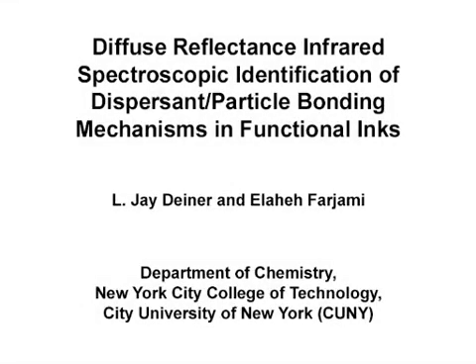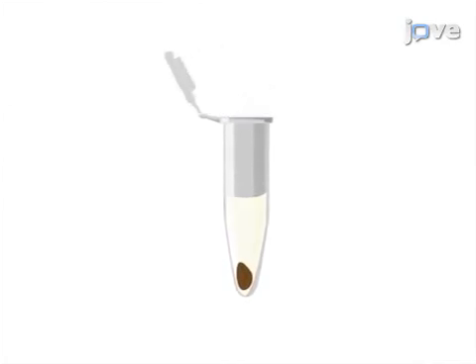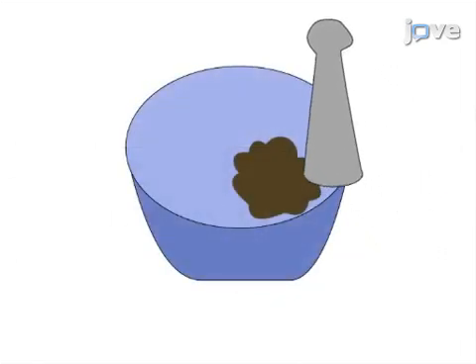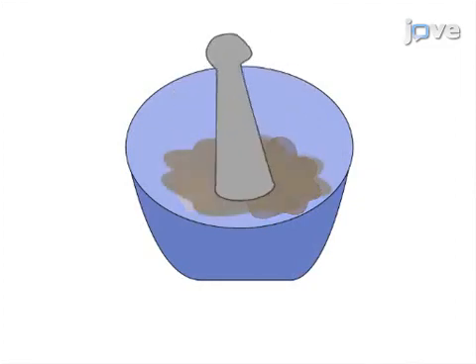The overall goal of this procedure is to identify the dispersant molecules adsorbed on dispersed particles within colloidal dispersions. This is accomplished by first centrifuging the colloidal solution to separate the particles from dispersant. Next, the isolated particles are washed with solvents, recovered with centrifugation, and oven dried. The dried sediment is then mixed within a potassium bromide matrix and ground into a fine powder.